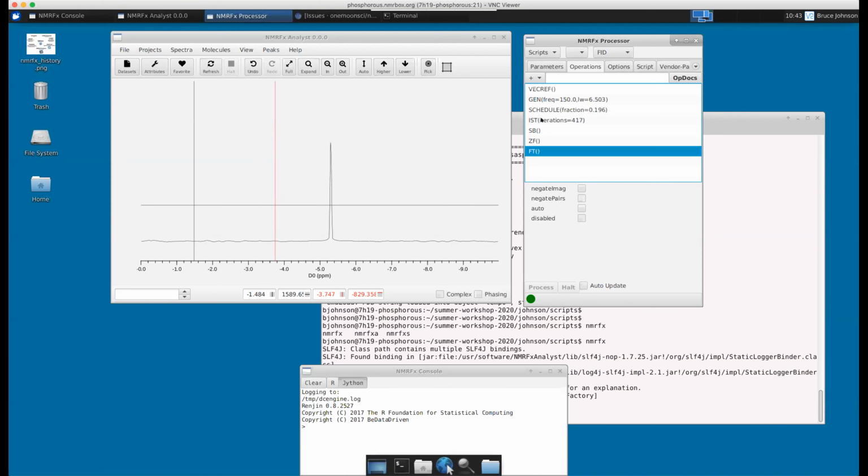Michelle Gill, who really finished up and did the lion's share of the work on the Nesta algorithm from our lab, actually found non-standard Fourier transform routines, really optimized, and spent a lot of time coding how you manage this data. Because when you get to 3 and 4 dimensions, there are so many FTs. It's kind of like the number of possibilities in molecular dynamics, it just explodes on you tremendously.